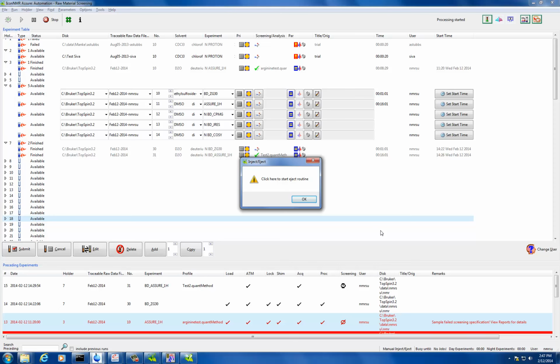Just a quick question. You guys have a juice analyzer, right? Now, what juices does it analyze for? Apple, actually any juice, like apple, orange, grape. Does it analyze for cranberry? Well, we have a quantification method that will take all of the sugar, citrate, and all that, but nothing that's specific to that fruit.